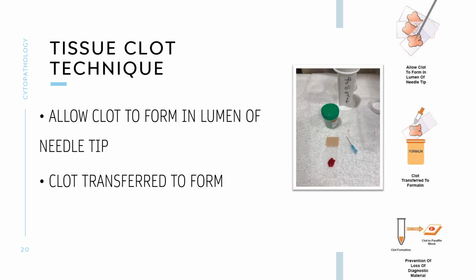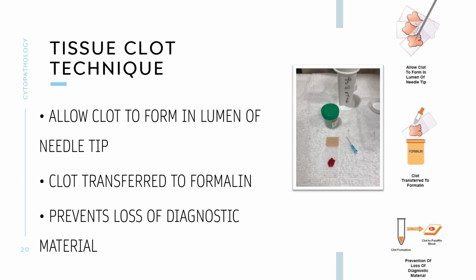Okay, so the tissue clot technique. You allow the clot to form in the lumen of the needle tip. Then the clot is transferred to formalin. So this prevents the loss of diagnostic material. So we have the procedure here.